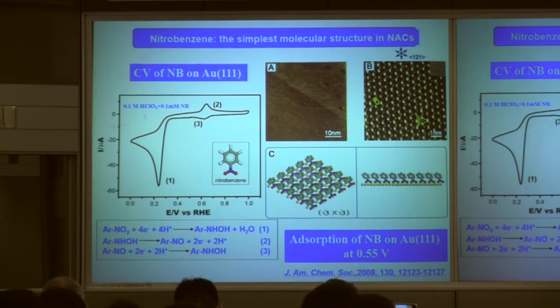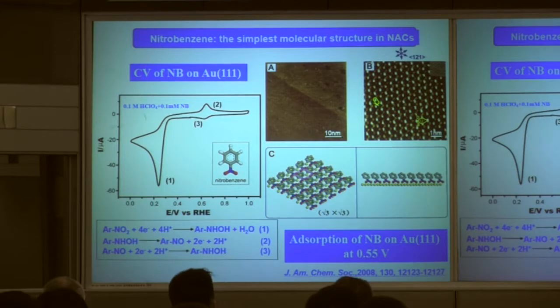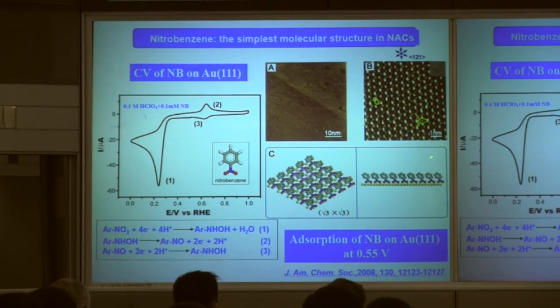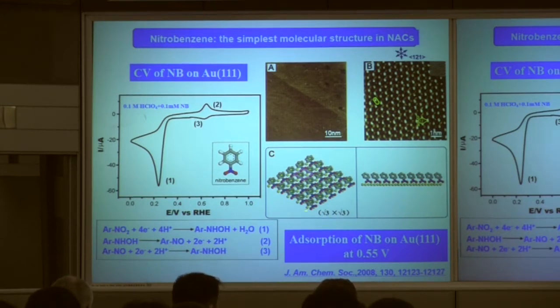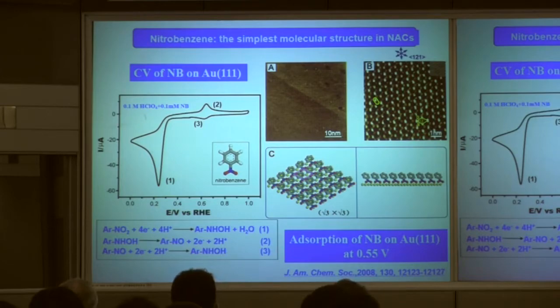According to the STM image, theoretical calculations, and the features of this molecule, we can understand that the bright spot corresponds to the benzene ring, and the smaller, slightly darker spot corresponds to the nitro functional group. From the distance and orientation of the molecular rows, we conclude the molecule takes a vertical orientation on the Au(111) surface — a √3 structure. Here is the corresponding structural model.